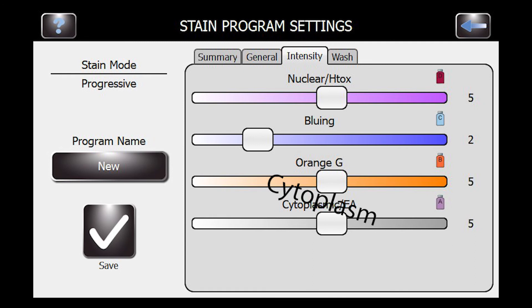If the orange is pretty intense, the first step would be to turn down the OG a little bit. There are also some washes that we'll get into in a minute. That covers the intensity tab.